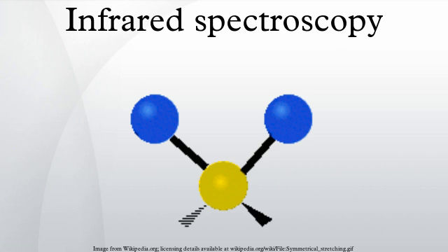Absorption bands. IR spectroscopy is often used to identify structures because functional groups give rise to characteristic bands both in terms of intensity and position. The positions of these bands are summarized in correlation tables as shown below. Wave numbers are listed in cm^-1.